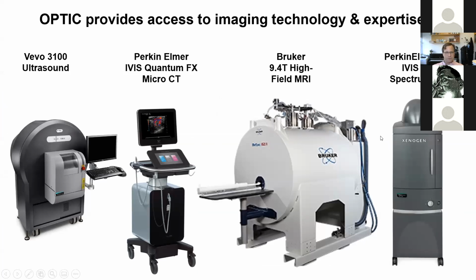They have a mouse micro PET CT instrument in their facility, and they have access, of course, to the linear accelerator there for making various isotopes and tracers. They've become very good at making experimental tracers. If you're interested in this, I would strongly encourage you to reach out to our team. We can connect you to Akiva, or you can reach out to him directly, and we can help coordinate different types of imaging being applied to the same animals, even in some cases.